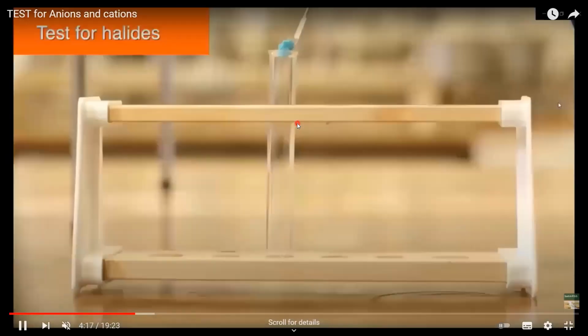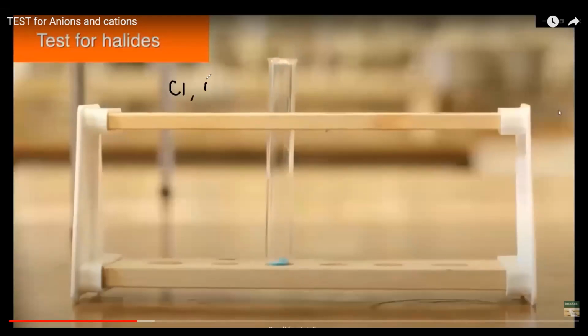Then if we want to test the halide ion, we don't know which halide. The term halide, what is the meaning of halide? It can be fluoride, but that's not part of your syllabus, that's why you don't have to learn. It can be chloride, bromide or iodide. Any of these ions can be there.